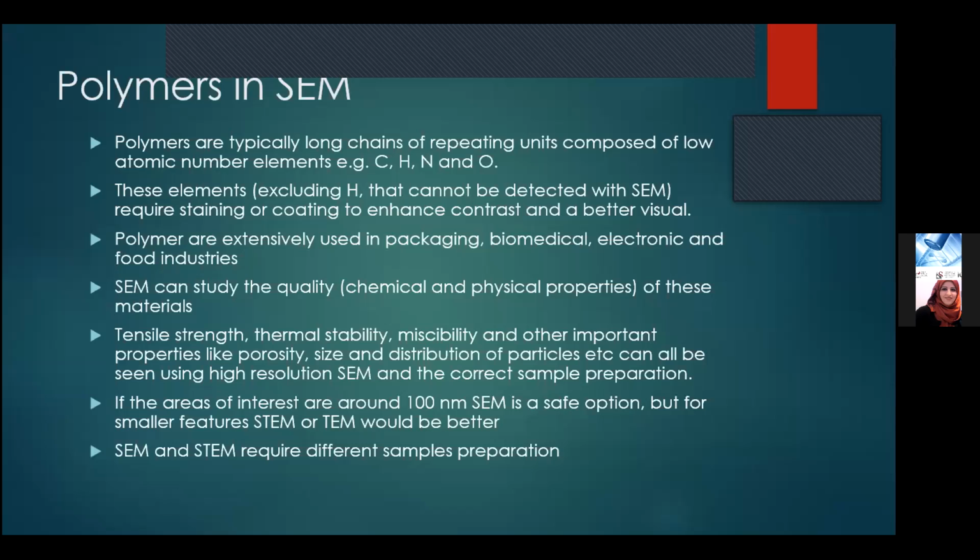So if you want to check, for instance, the porosity or size or distribution of particles, and also just in general the features that you were hoping to see, like I've mentioned, using high resolution SEM is very, very important. And also using the correct sample preparation before you actually go for an SEM evaluation is key.